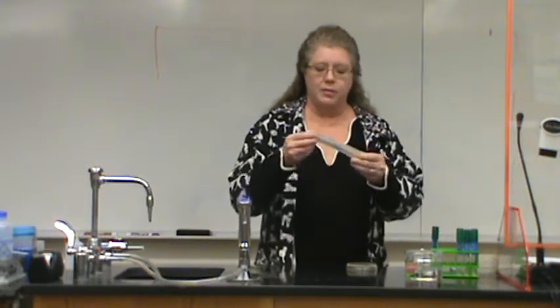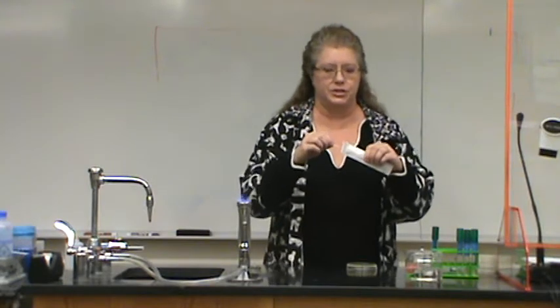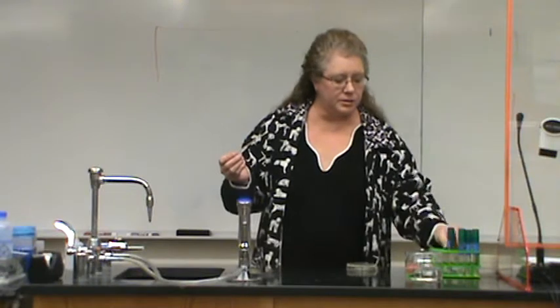Okay, so we pick up our sterile swab, and just like a Band-Aid, peel it down. Grab the stick end. If you open the wrong end and grab the swab, you've got to get a new swab because that's not sterile anymore, right? We all know this. So pull out the swab, it's sterile. You're going to pick up your tube of Staph aureus. Remember, remove the lid, clean the top, take your sterile swab, go in and soak it real good. Press on the inside edge just so you don't drip it all over when you come out, okay? And then flame the top. Remember, using aseptic technique. Put your tube down.